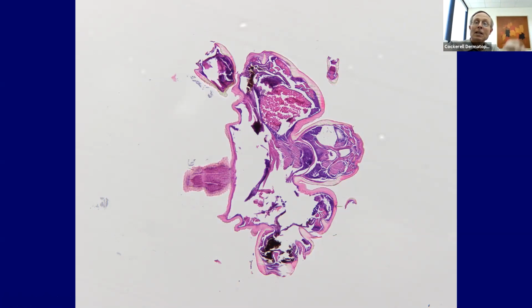It looks kind of like a long football. It's got rings of black spines around it. We don't have that here. We got this little guy that's got a couple of arms here. These are his little pincers at the edge here. Look at that, looks like a claw.